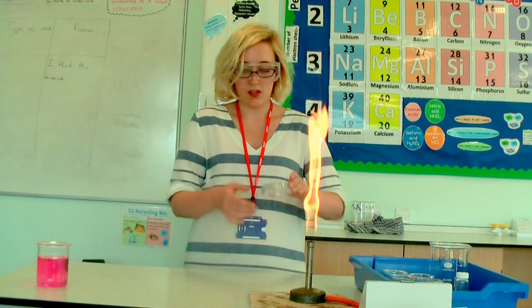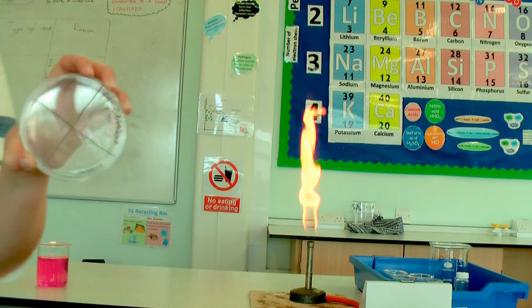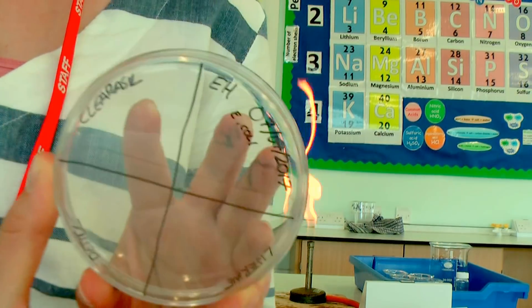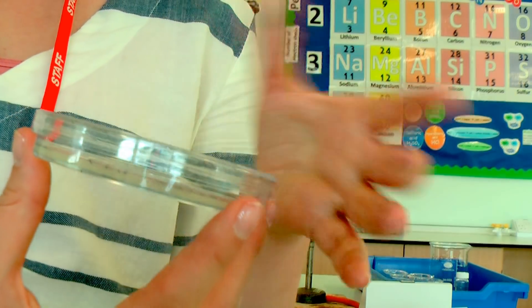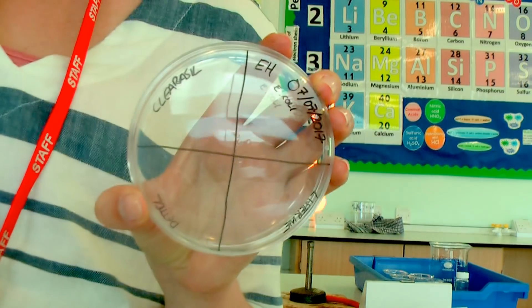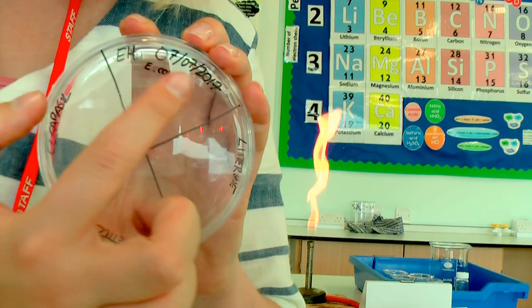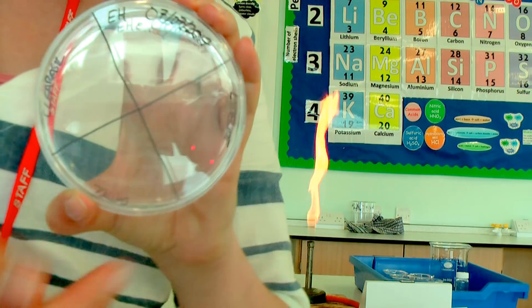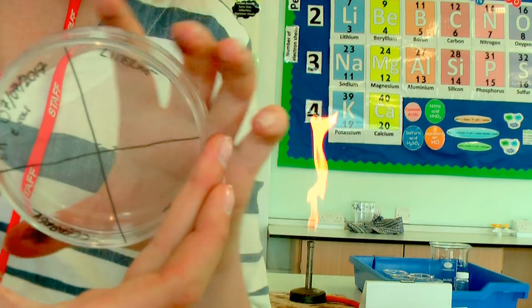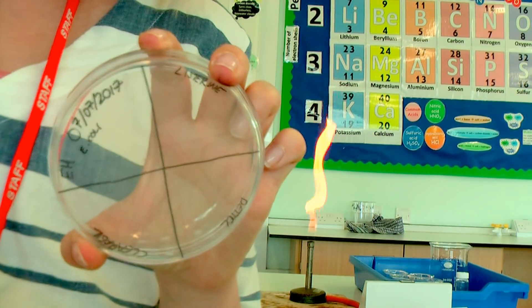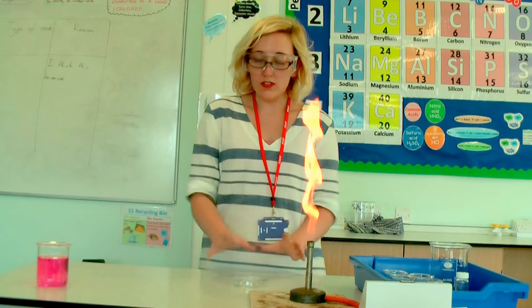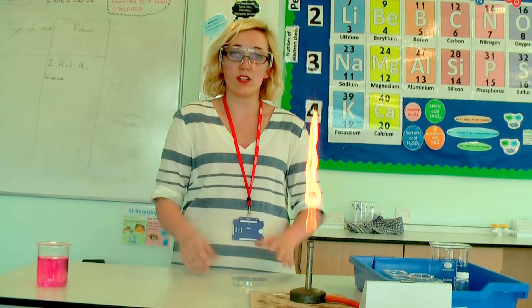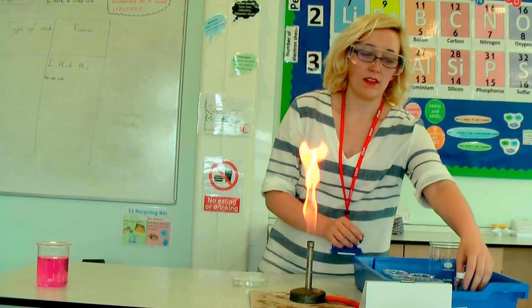You'll need some sellotape and a Sharpie pen. The very first thing to do when we get our equipment is to label everything up. Here is the petri dish I've already labelled. I have written all of this information on the bottom of the plate where the agar jelly is — if I wrote it on the top it could rotate and the labels would no longer match. Divide your plate into four sections and write your initials, the date, and the type of bacteria you're using. In each of your four zones, write the three different kinds of disinfectant you're using — I'm using Clearasil, Dettol, and Listerine.